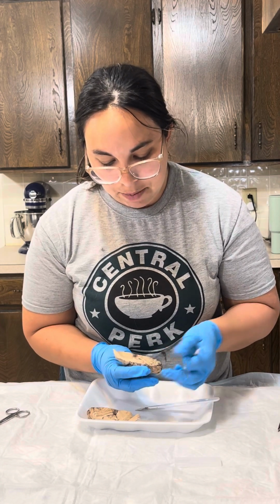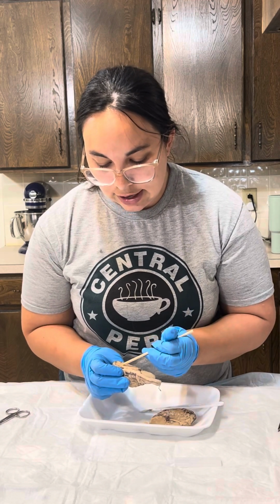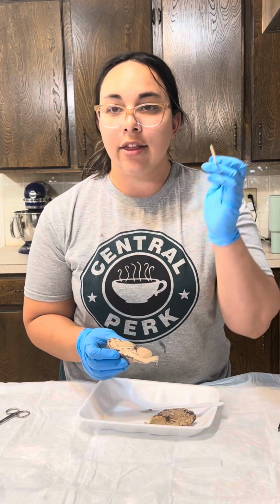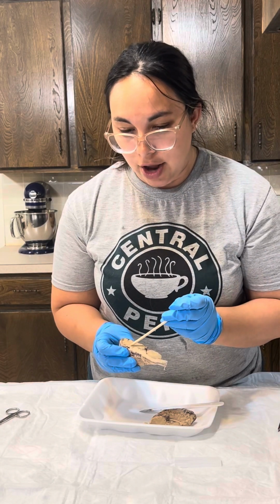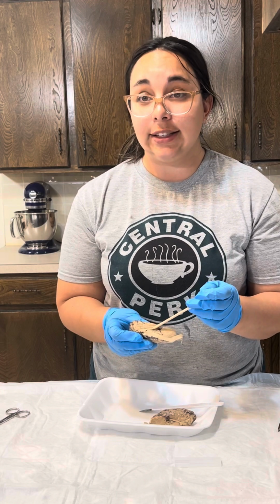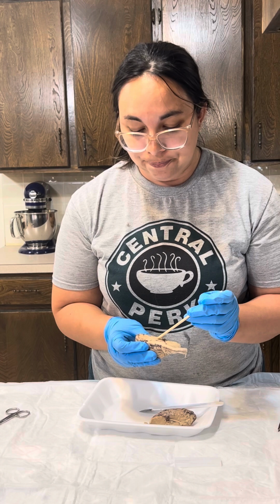I like this one better. It's the piece that comes back and forth between both sides. And then the bottom part of it is called the fornix. Those are the 2 parts right there.